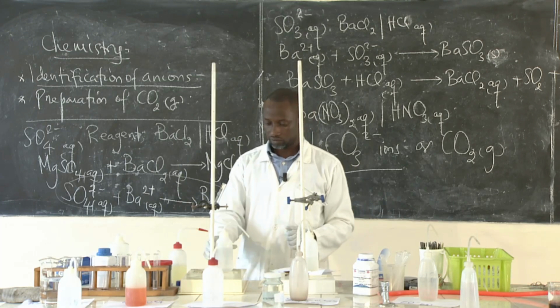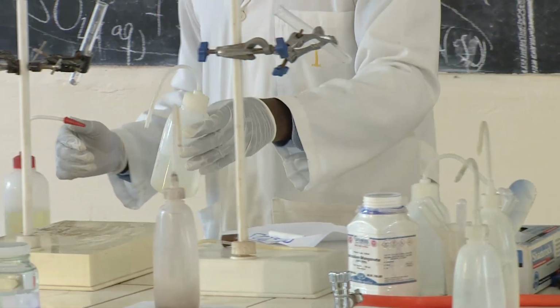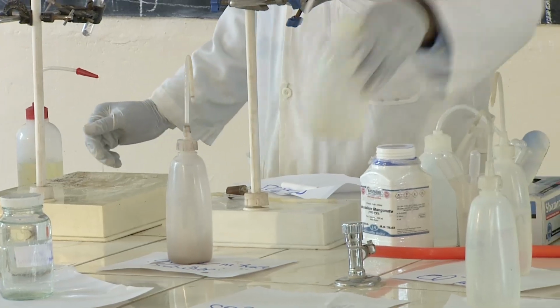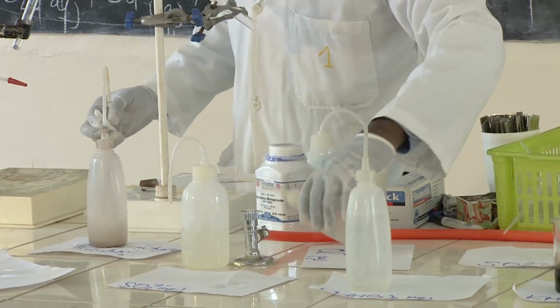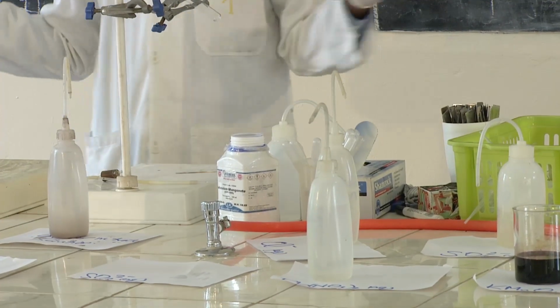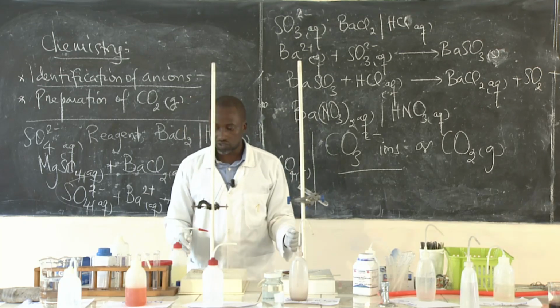We usually, in the laboratory, this is what we do. We just need a carbonate. Any carbonate can be used to prepare the carbon dioxide.